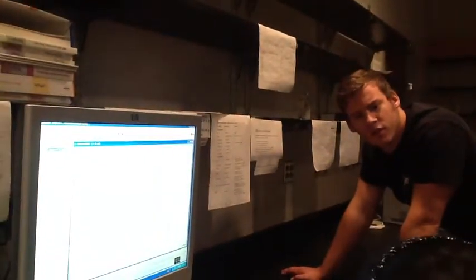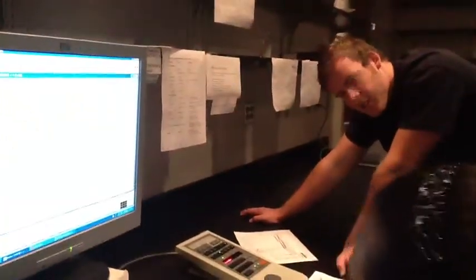Okay, but you said it was like GC. It was like GC, yes, so I'm just saying, use that same analogy where you can compare the two integrations and tell me that there's 50%. This will be 1, and then you divide that by 1, so it'll be 0.5. That's what you said, 75%, right? 25%. There you go.